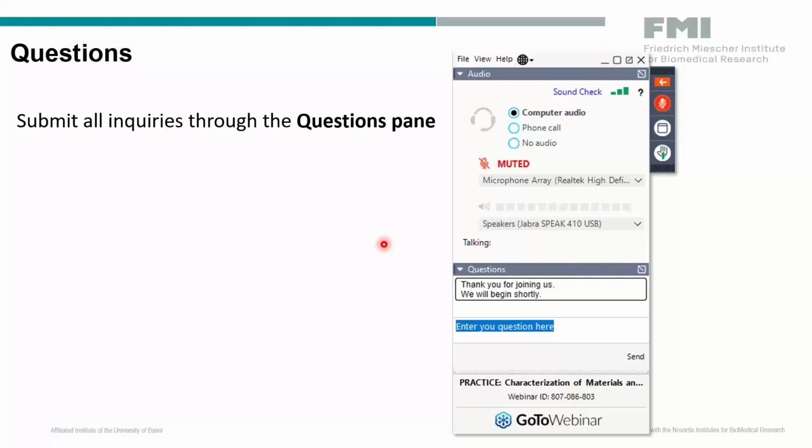So the more, the better. For Rainer Friedrich's application, I think that's around the time we need to acquire for his scientific questions. But sometimes we also have cells and other samples, and then it's more days of acquisition. But for Connectomics, you can count on weeks, and that could sometimes be challenging.